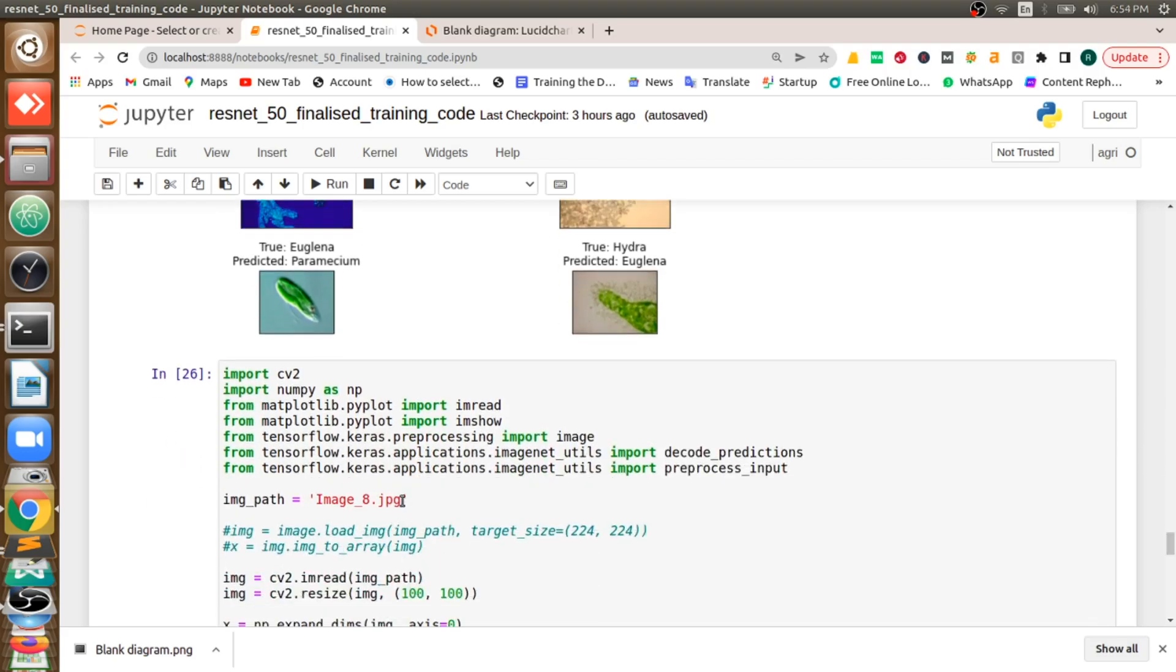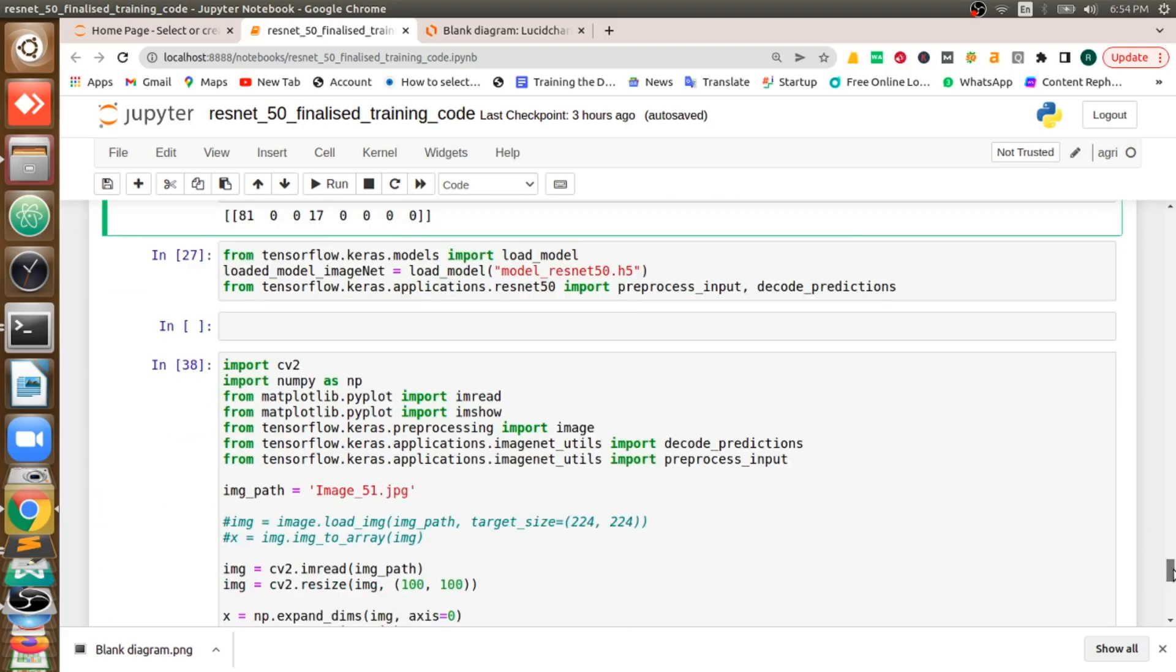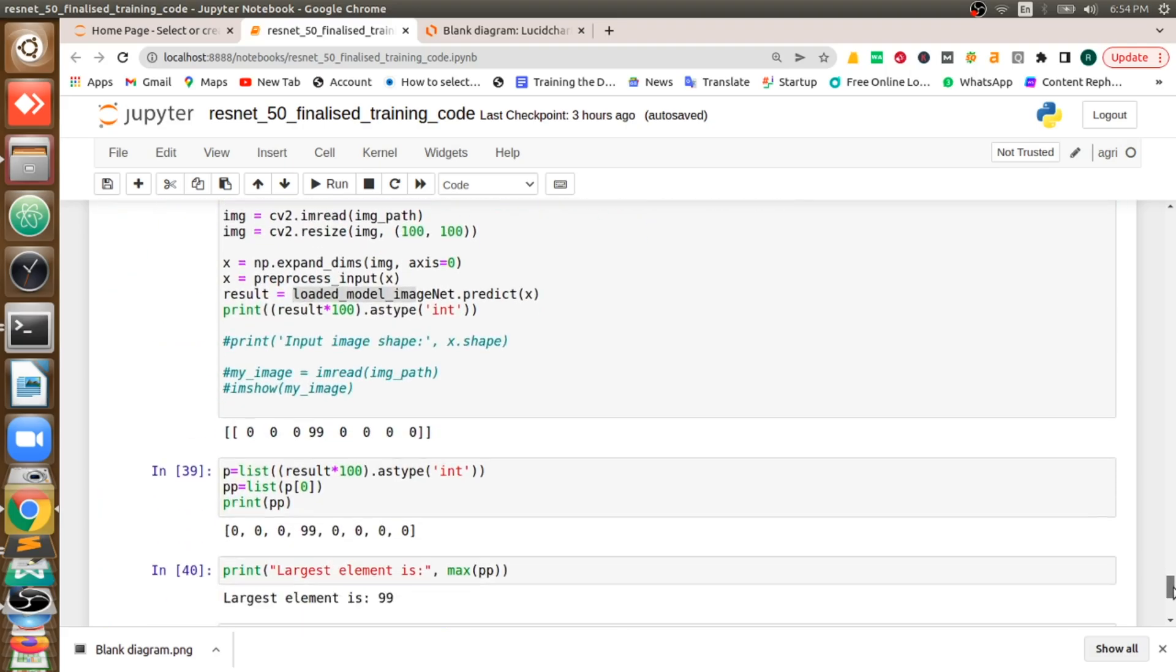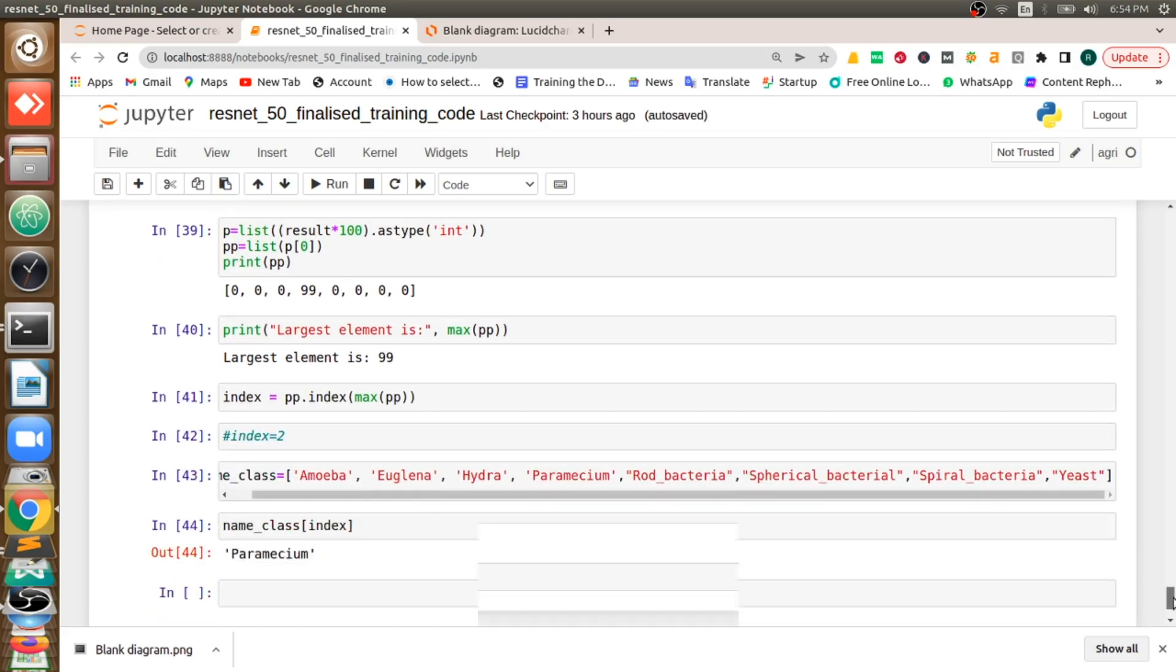So now what if you can give separate image as an input? So here you can see that I done at the starting of this video. So when I give paramecium, it's giving an output of paramecium.